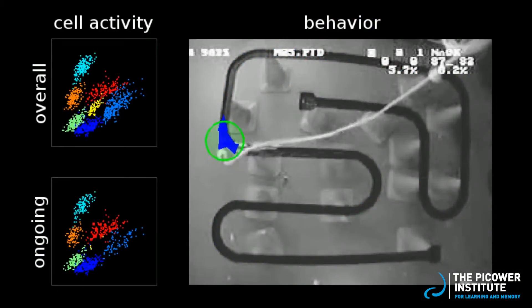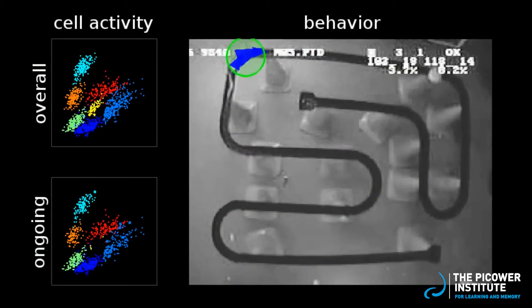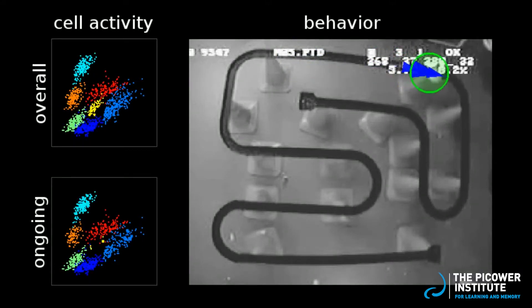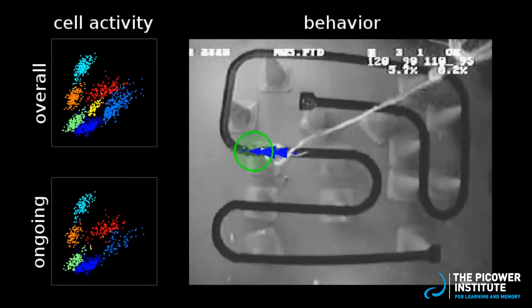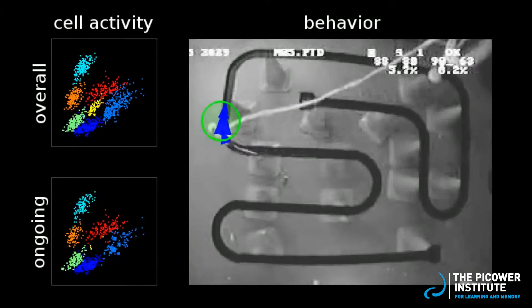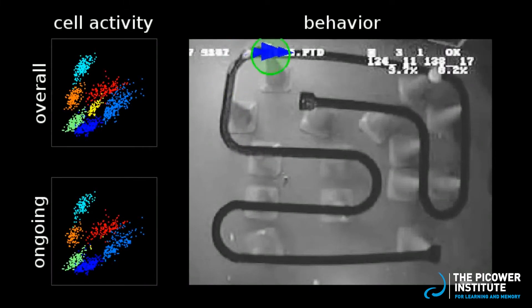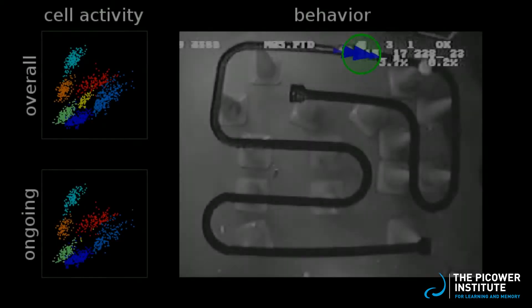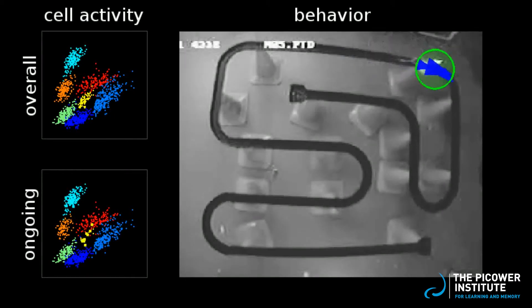The place cells allow us to decode the rat's location from brain activity. In this video, blue arrows predict where the rat is located based only on the place cell activity. The predicted locations of the blue arrows are almost perfectly aligned with the rat's actual position. So, if the lights were turned off and we couldn't see him, we would still be able to figure out the rat's location by reading his brain activity.